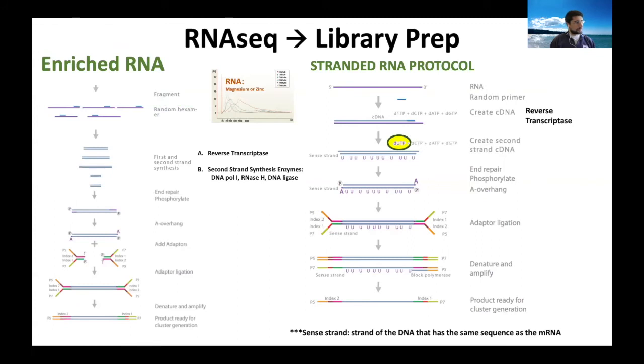So far, I hope everything is clear. I'm adding new information here, which I think is really important. The protocol that I described to you is kind of old school. Nobody uses it anymore. Now everybody has switched to this stranded RNA protocol. The idea is exactly the same. There's just one little modification that you can see highlighted here in yellow on the right.